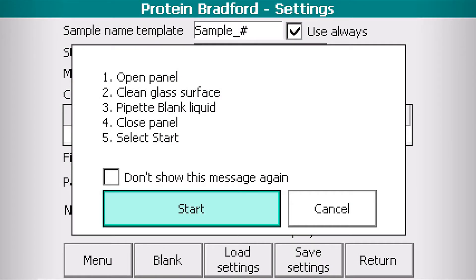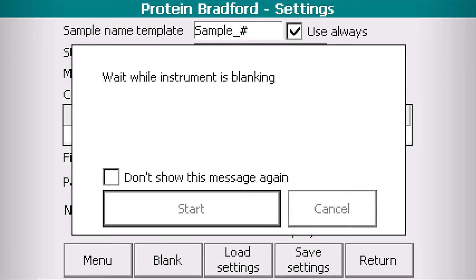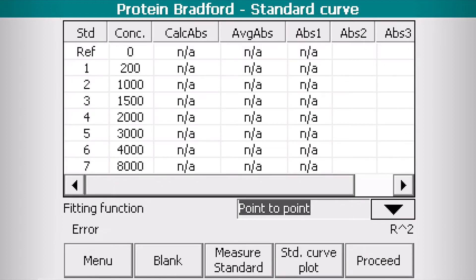Click Start and wait while the instrument is taking the blank. Now Colibri is ready for your standards.